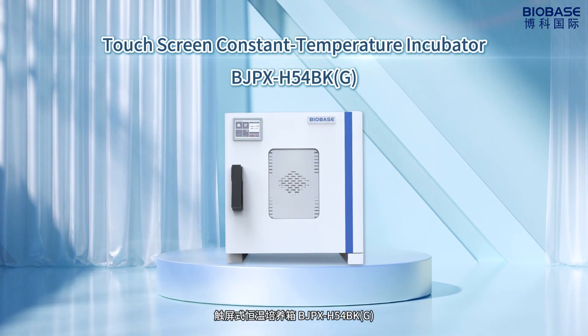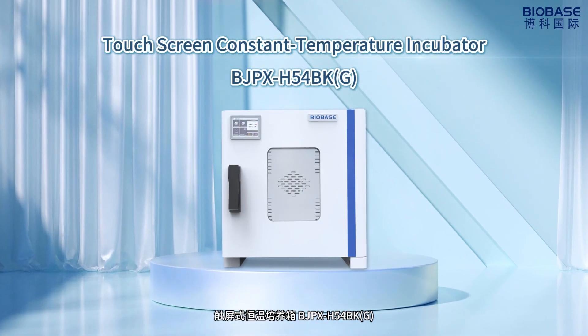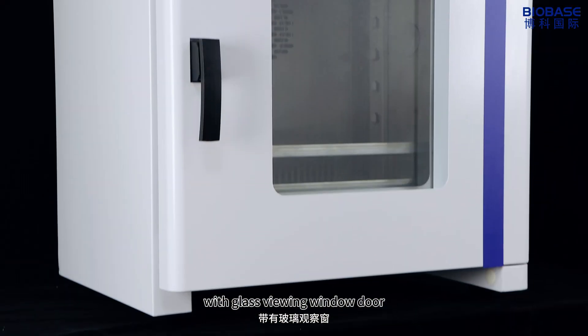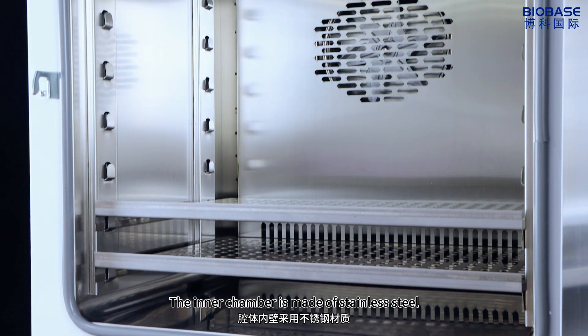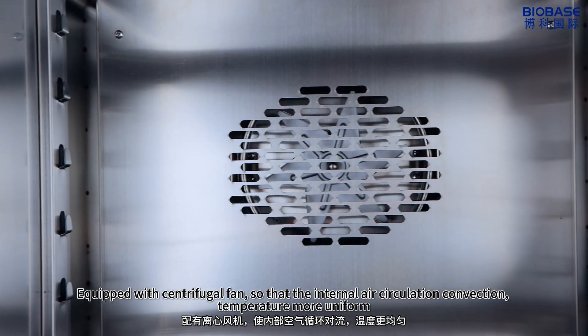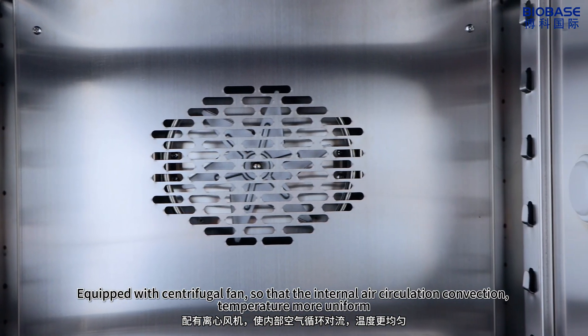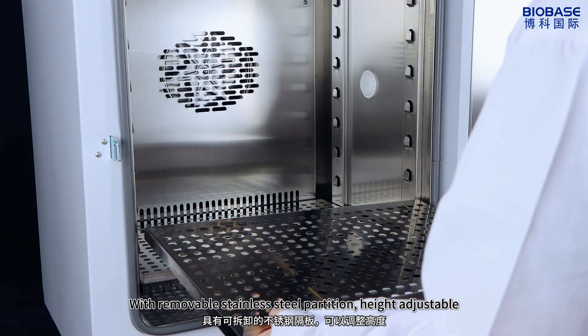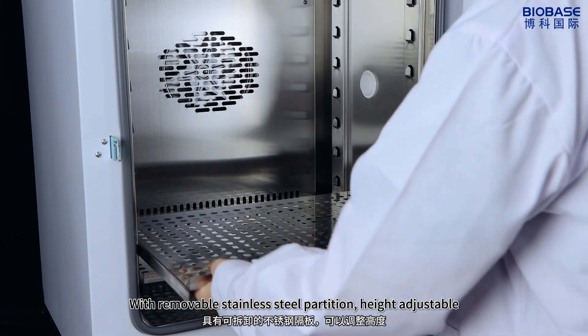Touchscreen Constant-Temperature Incubator BJPX-H54BK(G) with glass viewing window door. The inner chamber is made of stainless steel, equipped with a centrifugal fan so that internal air circulation and convection temperature is more uniform, with removable stainless steel partitions that are height adjustable.